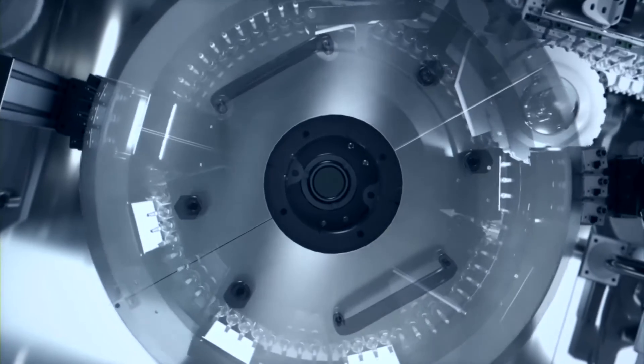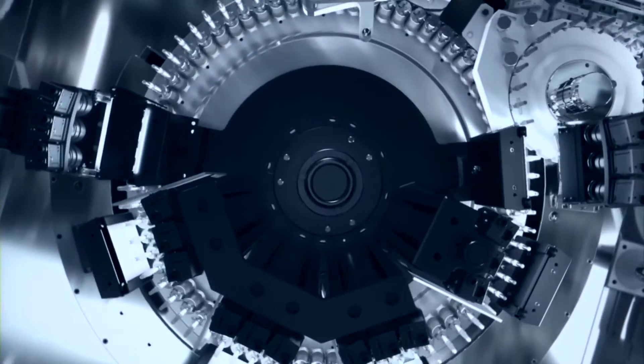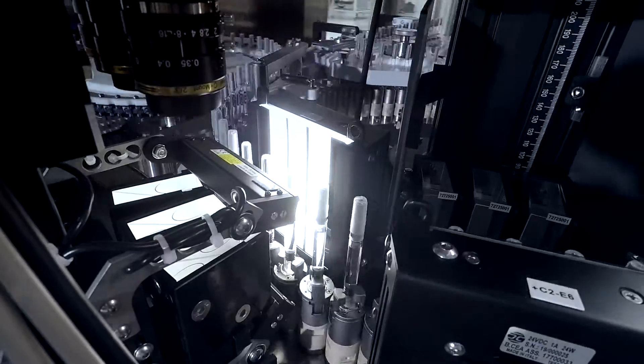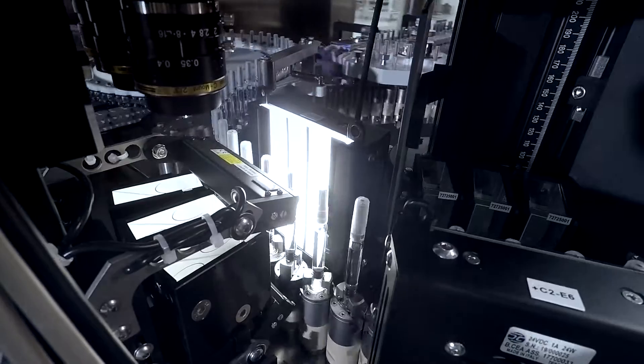High resolution cameras acquire up to 100 images on each particle inspection unit. This high number of frames is the key to ensuring accurate detection and low risk of false rejects.